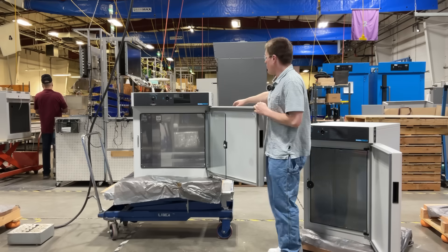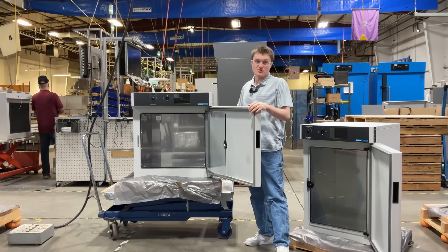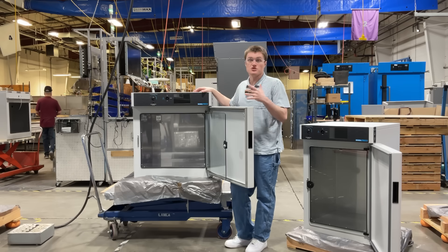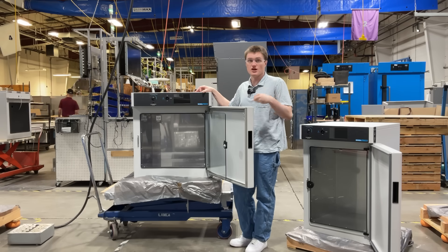You will also notice a one and three-quarters inch access port on the right side. Additionally, the units are made out of corrosion-resistant materials to help increase the longevity of your unit.